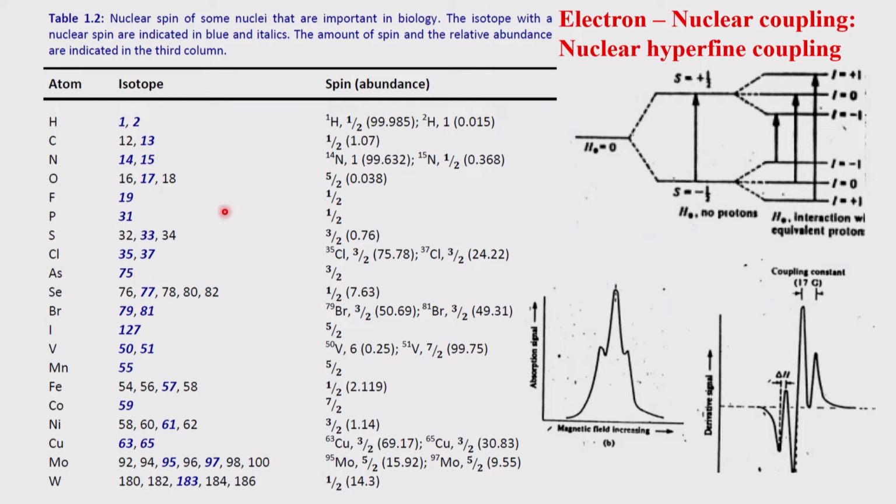So I again draw your attention to the table, because I am explaining the table with respect to that. So now you understand, when you take the carbon 12, which is 99%, can be ignored. Carbon 13 is only 1%, can be considered, should be considered, but 1% out of the 100 you will not be able to see the signals much. So if you make it 20% enrichment of the carbon 13 or so, or above 10%, you can start seeing the coupling for that. Otherwise you will not see the coupling for that. That's why in many of the cases they will use a carbon 13 labeled material and then correspondingly look at the signals.